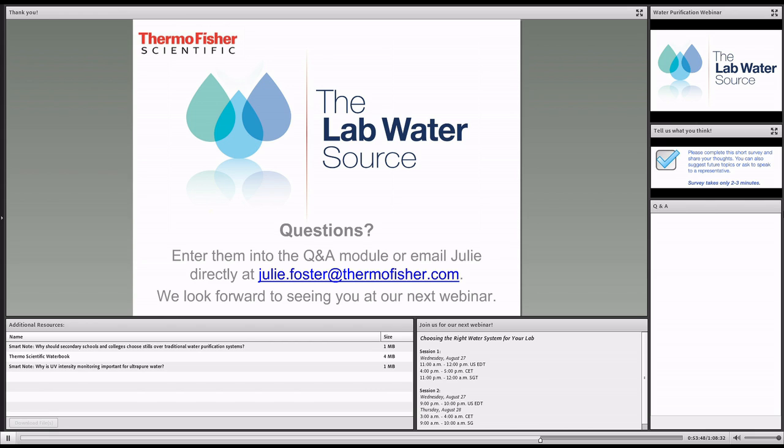How can I determine what impurities exist in my lab's feed water and what system would best remove whatever junk is in there? So there's different ways to do it. In the simplest way, if you're thinking about feeding a water system tap water, you can get your county's water record. You can call them up, and they'll send you a report on what's typically in your tap water.